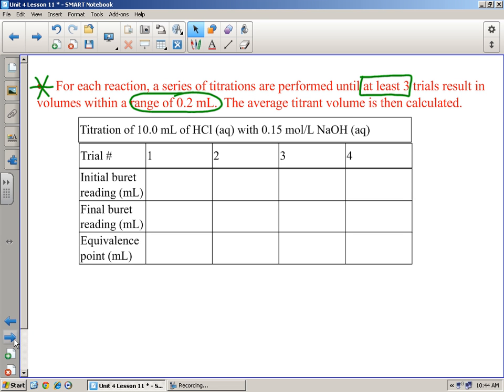To put it into your burette holder, you're just going to push back the middle tab. You can do either one on either side, and just slide it in there like so. I'm going to get this out of the way here. So that's your burette, and you need a holder for that, of course. We're going to look at this titration today.